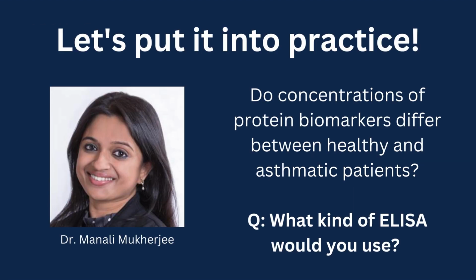Now that we're familiar with the different types of ELISA, let's put it into practice. Say you're a research assistant working in Dr. Manali Mukherjee's lab, investigating different biomarkers for asthma. You wish to test whether concentrations of a specific protein differ between healthy controls and asthmatic patients. What kind of ELISA would you use?